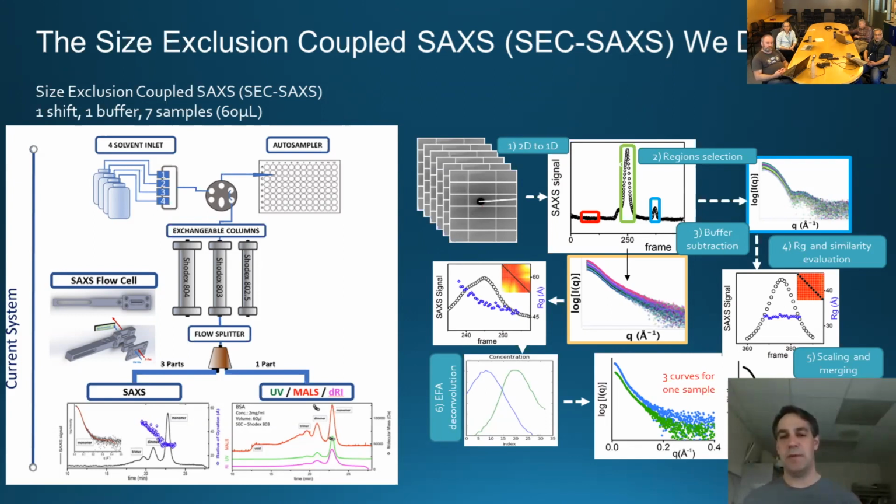There are 2 peaks here. If you average the results from this one peak, you get 1 scattering profile. This happens to be a heteromeric complex, so this is a monomeric version in excess, one of the monomers in excess. So that's that peak, and you get the scattering curve from that. And then you also get this scattering curve from this peak.